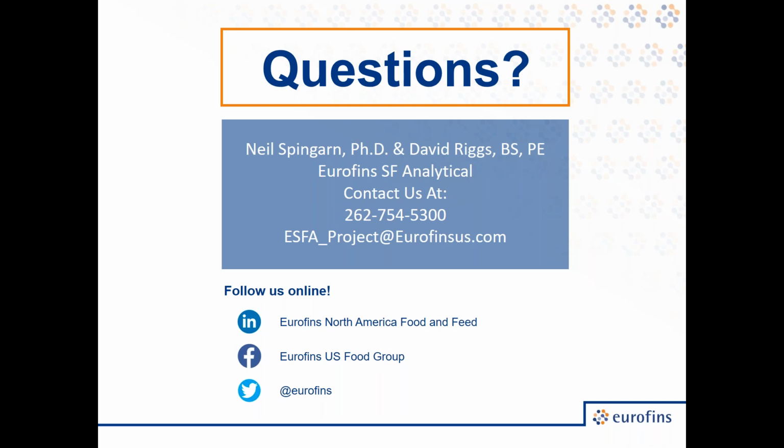We see so many different sources, everything from corrosion of equipment, improper cleaning of equipment, and insect infestations. We get herbs and spices where the standards are so high, with amounts of sand that's acceptable or traditional. You'd be amazed at how much garbage is in your normal food supply and is sometimes considered acceptable. So we see all kinds of stuff. And the question simply becomes, what's of concern?